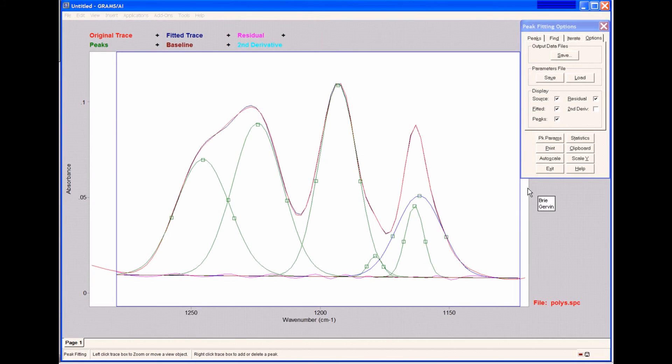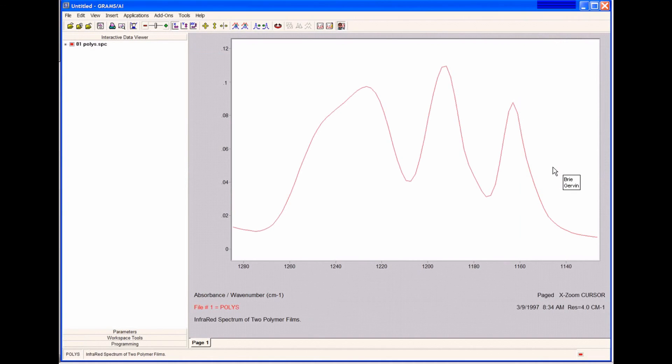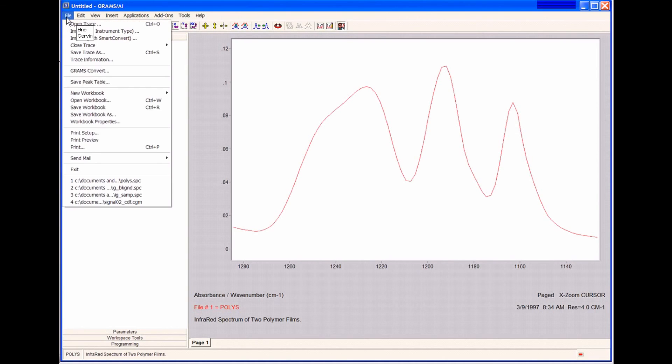When you're done with peak fitting, you simply choose Exit. It brings us back into Grams AI, and then we can open up some of the information we just saved.